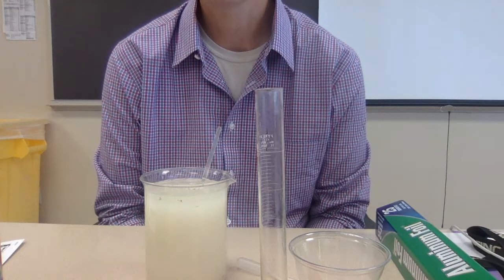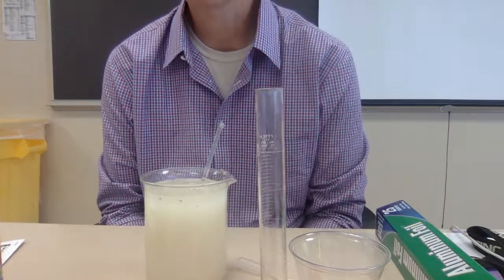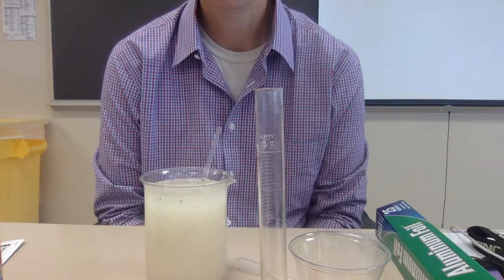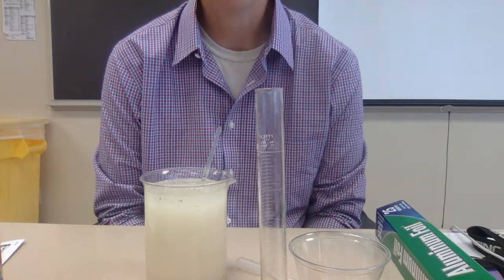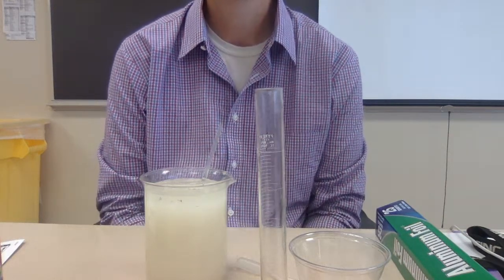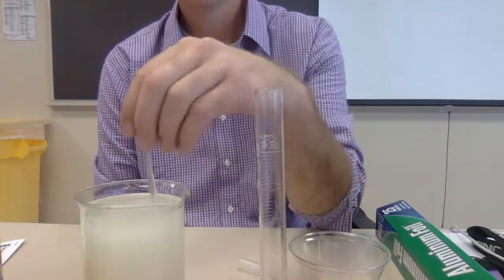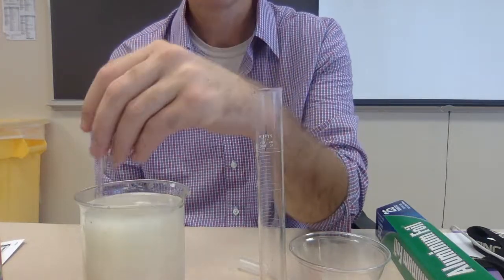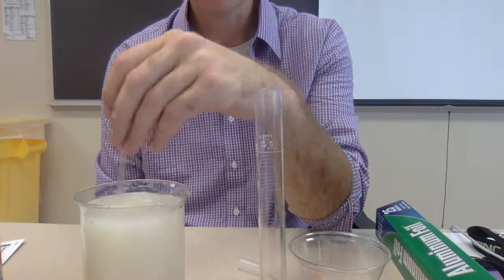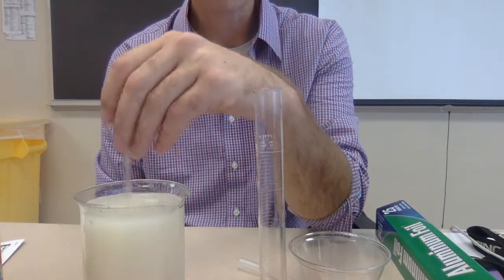All right, so the lab today, you're going to be basically setting them up in their environment, and then you are going to be making a first day count. Okay, so our yeast will be in a beaker like this. It'll look kind of yellow. Whoever's the first one that gets there for your class period, make sure you stir it up a little bit so that we get a good mixture of yeast and water.